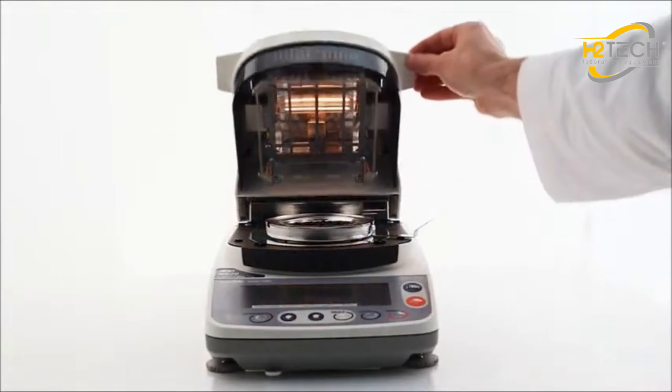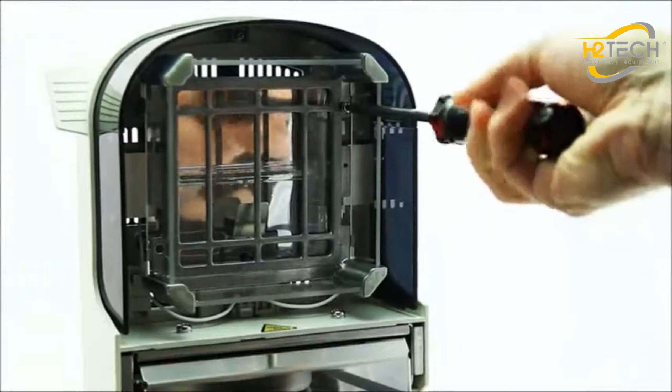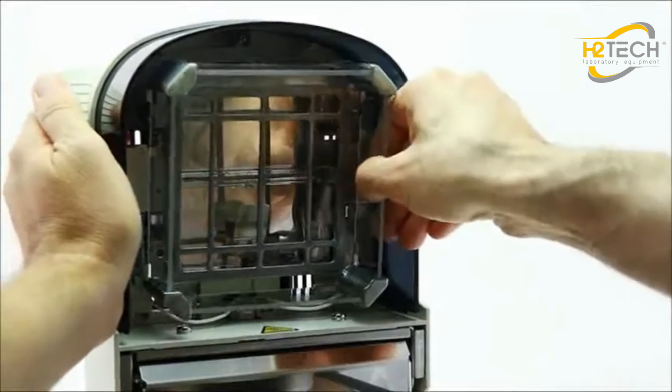Together with a powerful 400-watt lamp, the patented secondary radiation assist provides controlled, uniform heating to quickly dry samples. The halogen bulb offers a long life of 5,000 hours and is simple to replace.